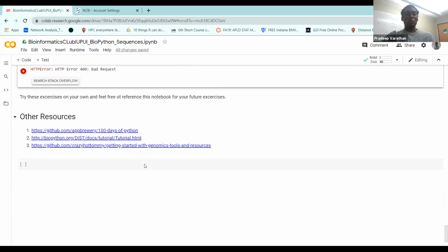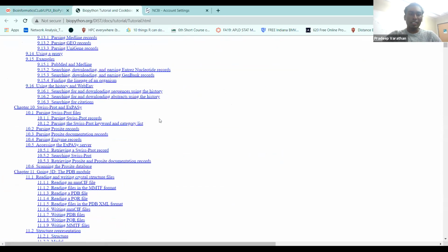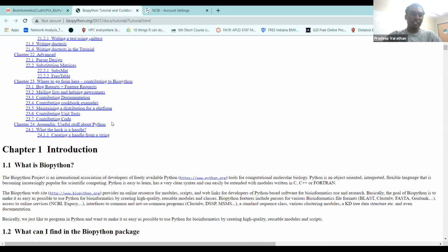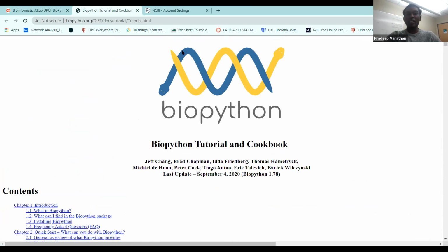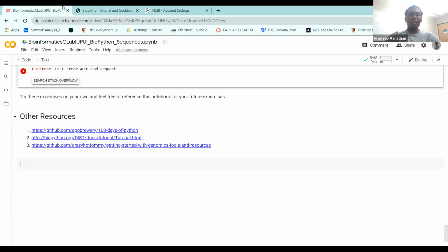But yeah, to wrap it up, we have the resources that are available. I have multiple GitHub pages and a BioPython tutorial HTML. Feel free to look it up. This is where I got most of my resources from. You have 24 chapters worth of BioPython tutorials, and it's always updated. The last update was September 4, 2020. There are multiple versions, and it always keeps adding new functions.